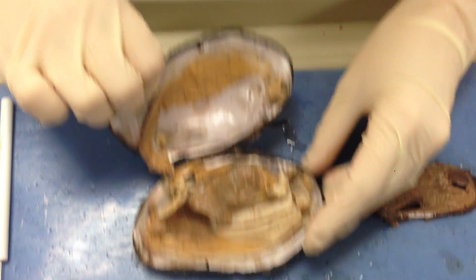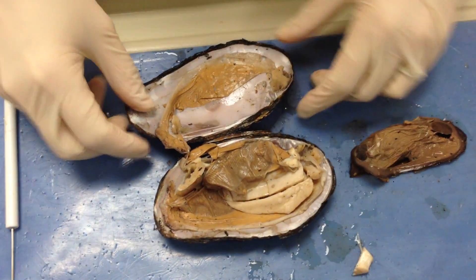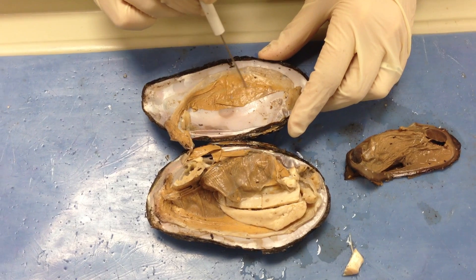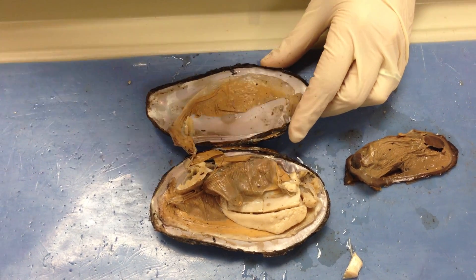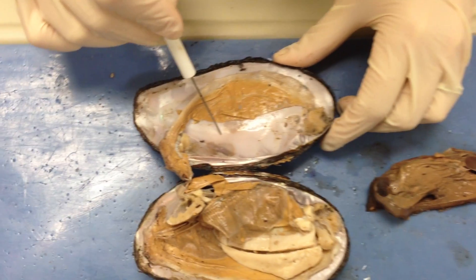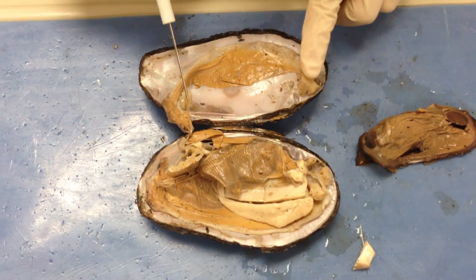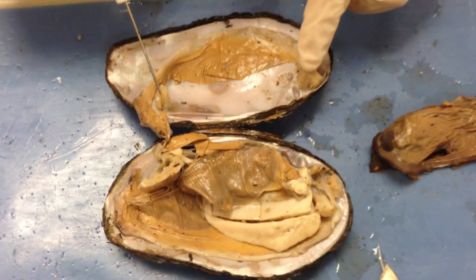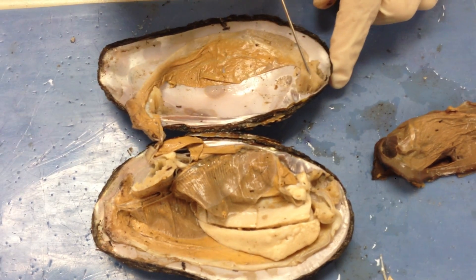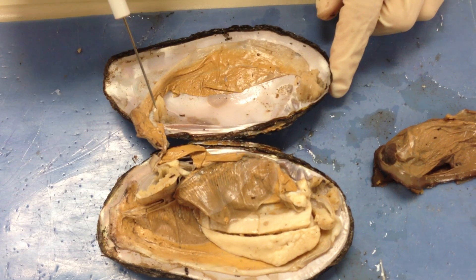If we open up the valves — remember these are bivalves, and each shell is considered a valve — we're going to see things like this structure right here, which is the mantle. It helps to secrete the shell, and the shiny stuff in the back is the mother of pearl. You can see these muscles right here, and these muscles are considered the adductor muscles, so we have the anterior adductor and the posterior adductor muscles.